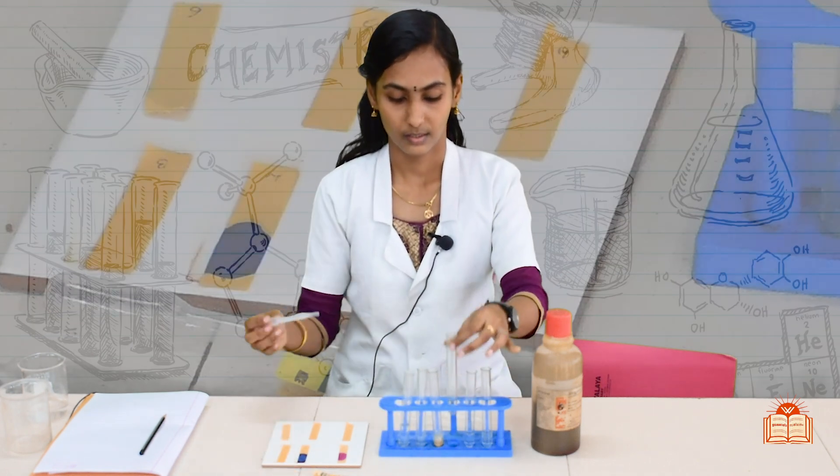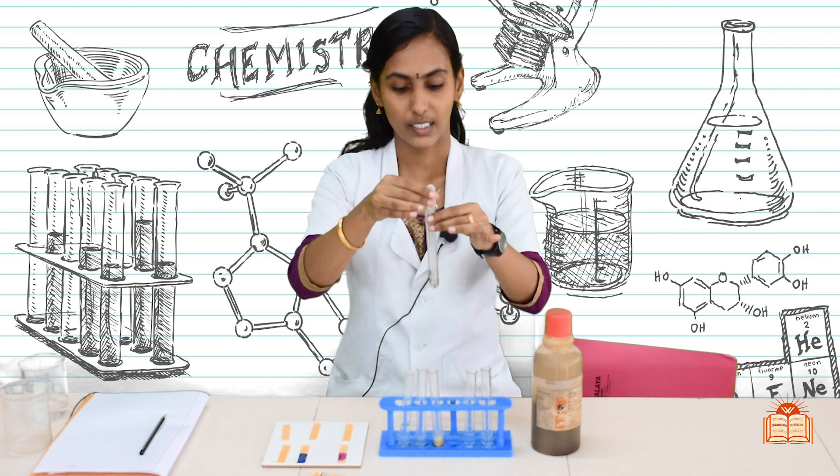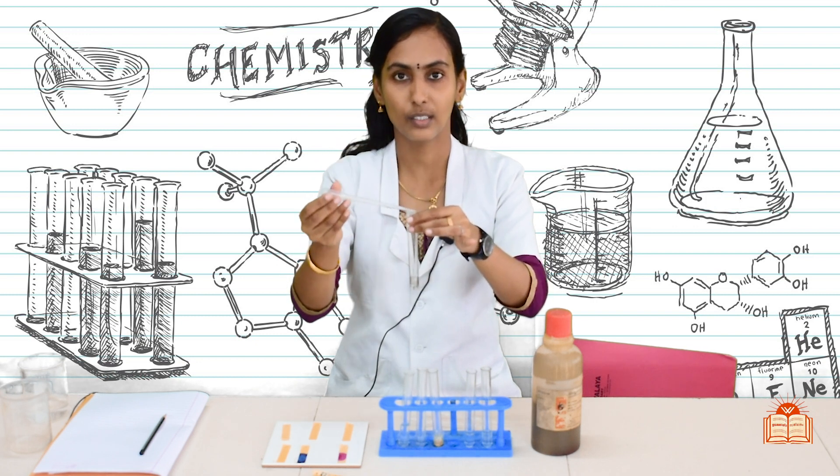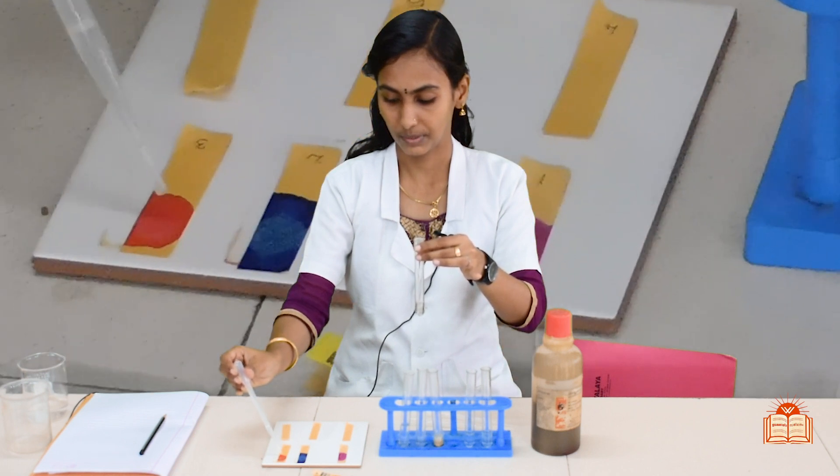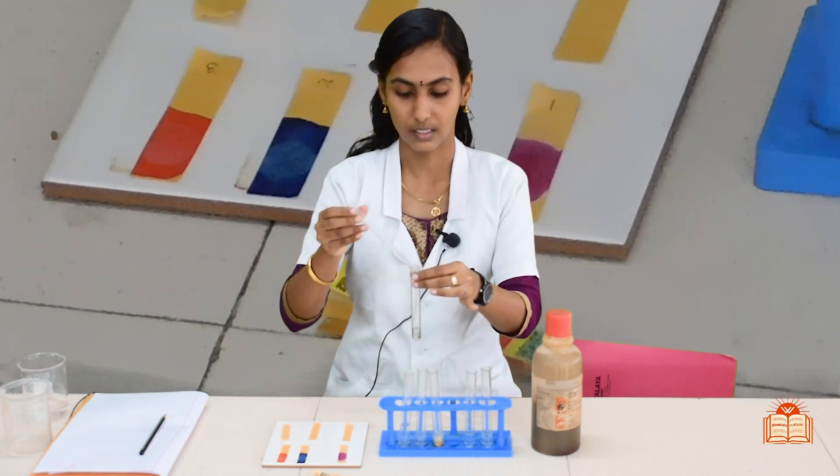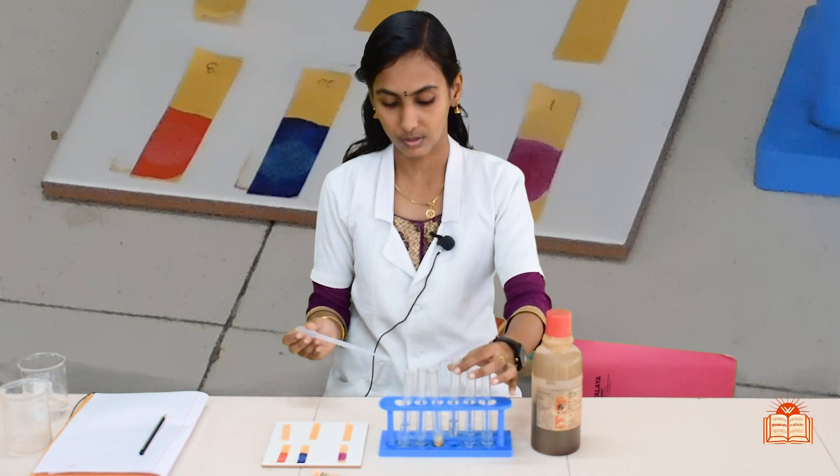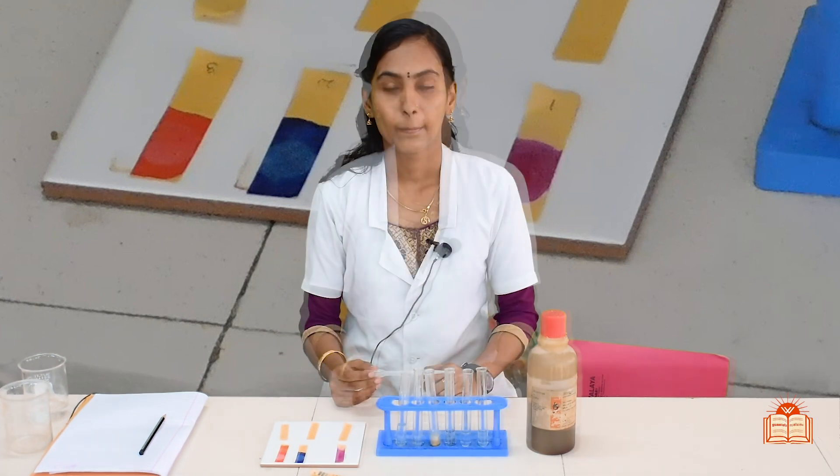Next one, acetic acid solution or ethanoic acid solution, we have to add to another strip of pH paper. Please observe the color change students.